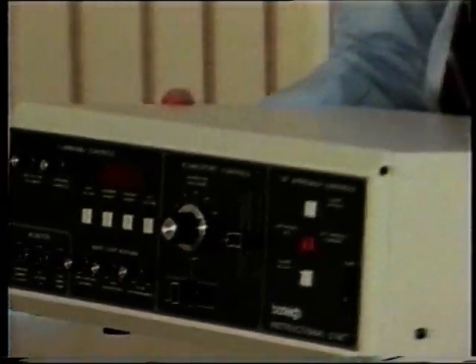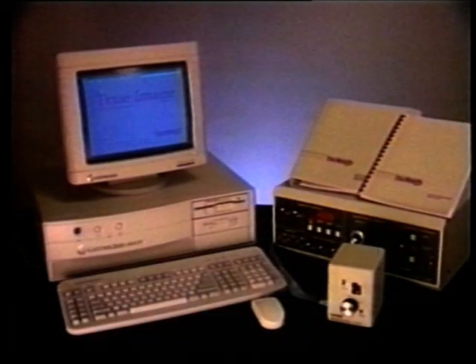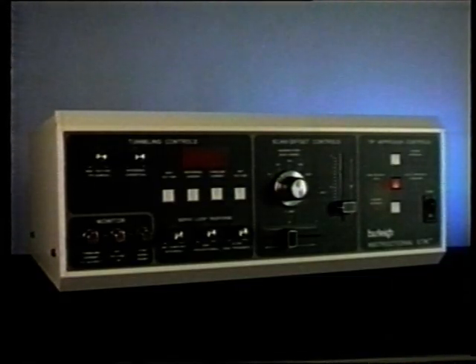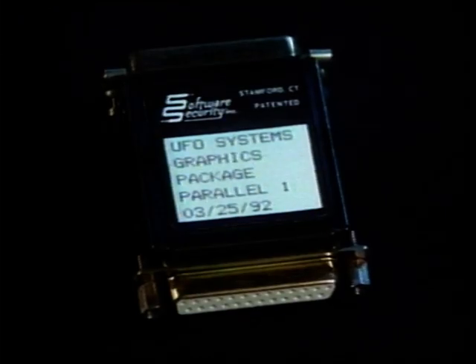With your Burleigh Instructional STM, you should be able to set up and acquire atomic images of surfaces in a matter of minutes. The Instructional STM comes complete with all the accessories you should need. It includes the STM scanning head, the control electronics unit, True Image software, a set of qualified samples and sampling accessories, an operation manual and a comprehensive student workbook, STM system connecting cables and power cord, and a software security key.